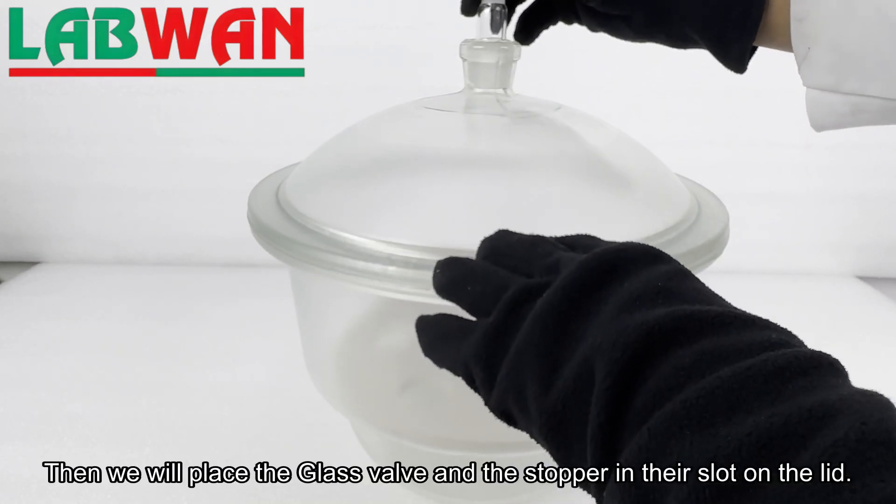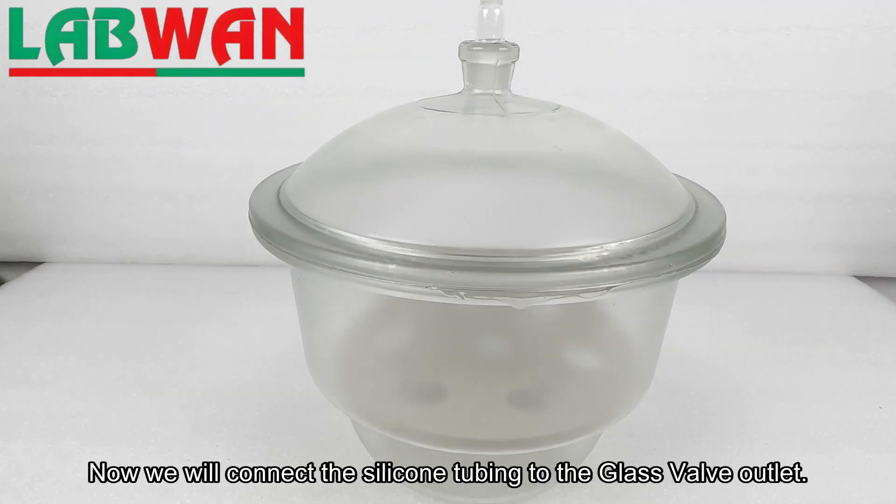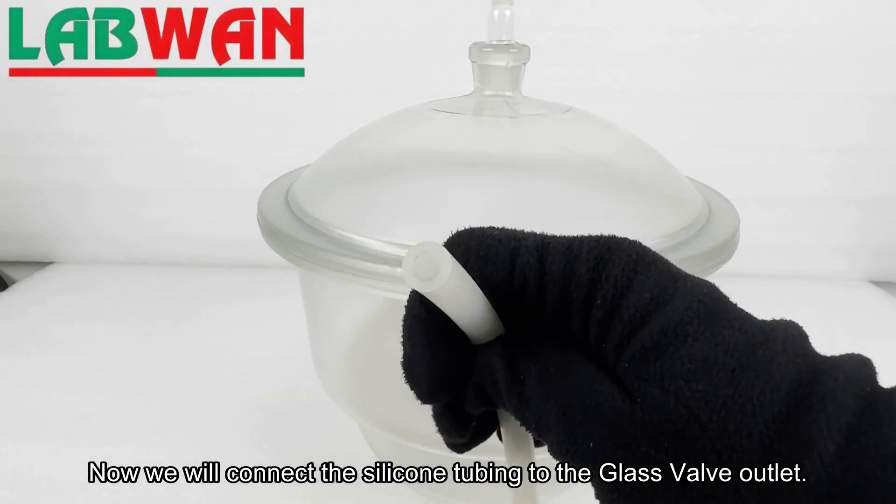Then we will place the glass valve and the stopper in their slot on the lid. Now we will connect the silicone tubing to the glass valve outlet.